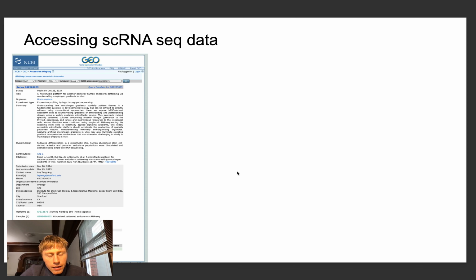So there are three files, and from those you can very simply transform this to an H5AD file. H5 files are organized in a hierarchical way, and the AD is a specific type of structure of this hierarchy. There are specific categories which have to be in there so they can be used in further downstream analysis, because the tools you use, for example Scanpy and Seurat, require a specific format.